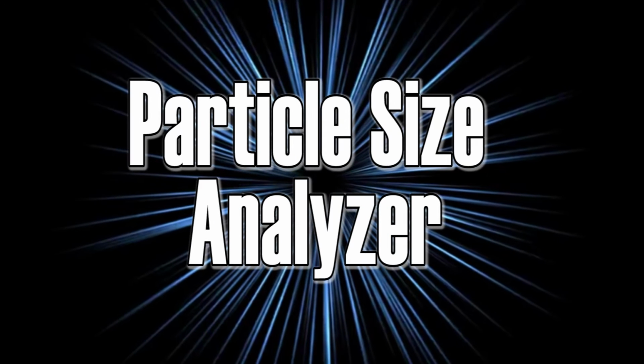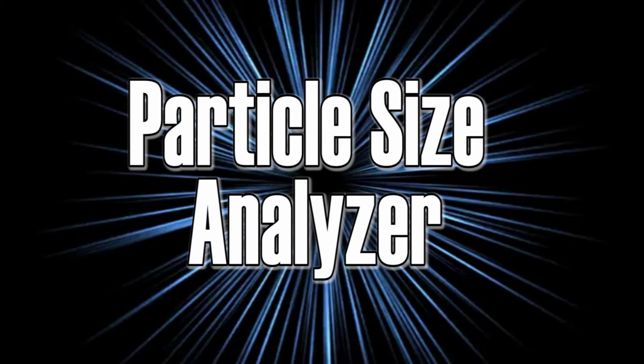In this video presentation, we will talk about the working principles behind the particle size analyzer, as well as the instrumentation, setup, calibration and measurement, maintenance and troubleshooting, and its applications to our society. So to begin with, a short introduction about particle size analyzer will be presented.